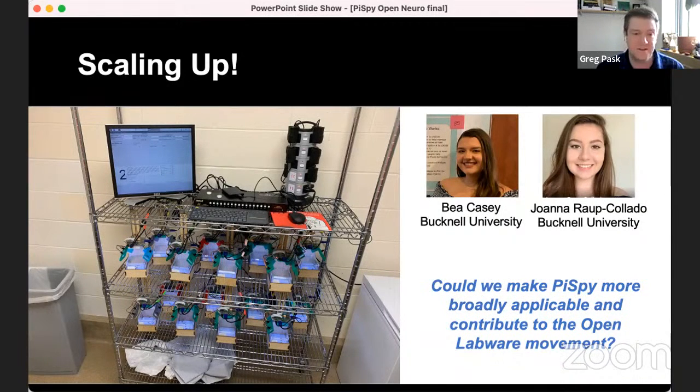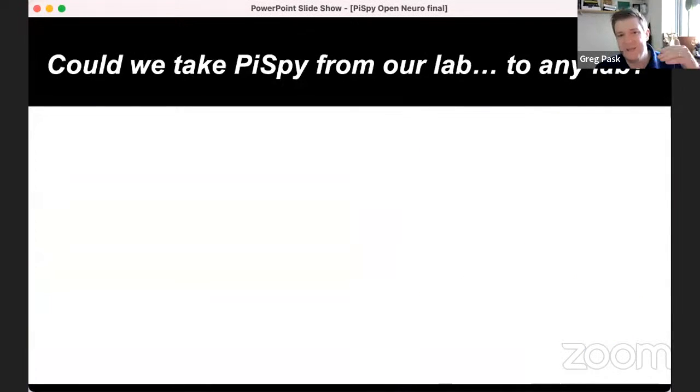And we were mostly taking videos at this point, but we thought, hey, could we actually go full, not just taking what we had seen demonstrated with the fly pie and doing it for ourselves and keeping it internal, but if there is this much use out there, could we make a nice contribution to the open labware movement? So this idea of, can we take PiSpy from our lab to any lab? And I think this is a common theme throughout all sorts of open source hardware and software that's out there.